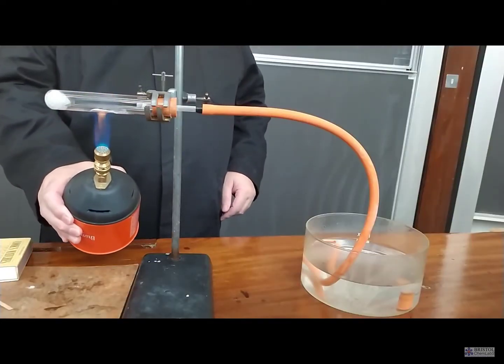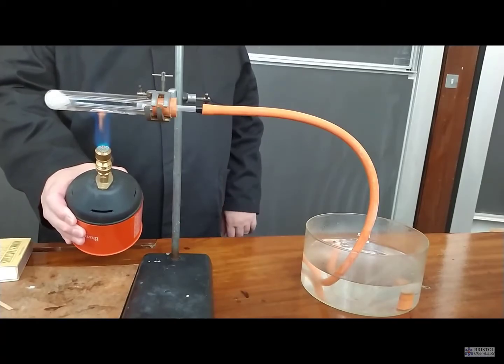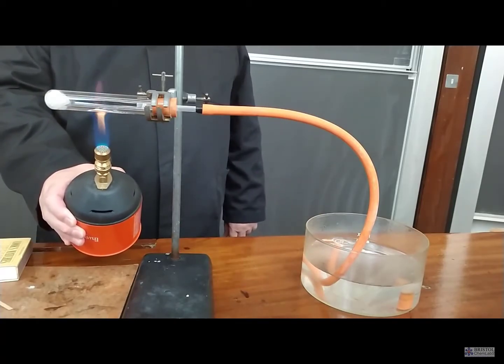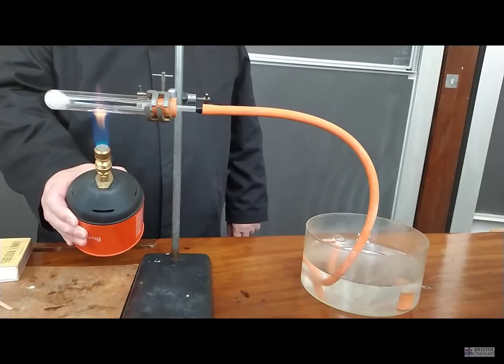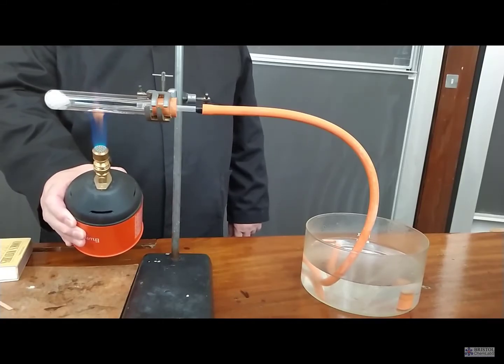So, using a suitable Bunsen burner with a long lead, or a portable Bunsen as I'm doing here, heat the aluminium oxide strongly.